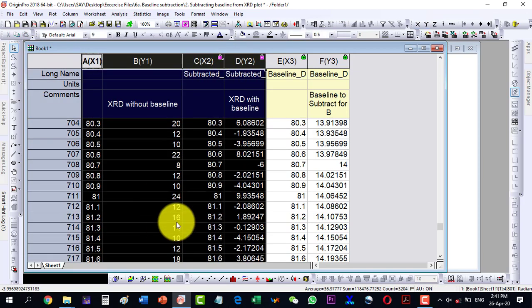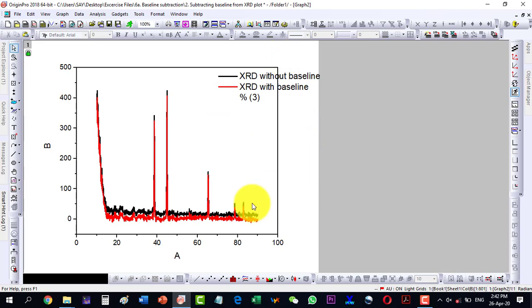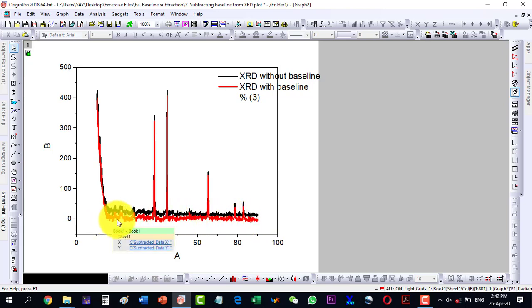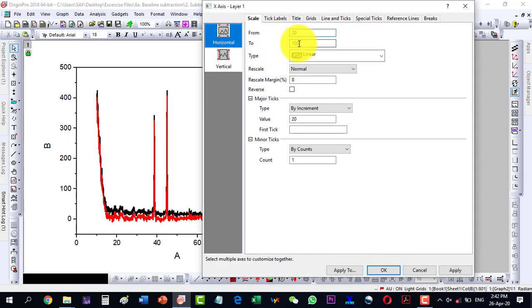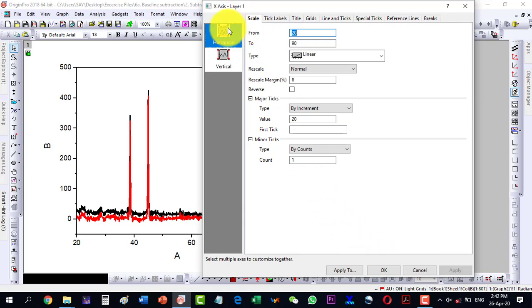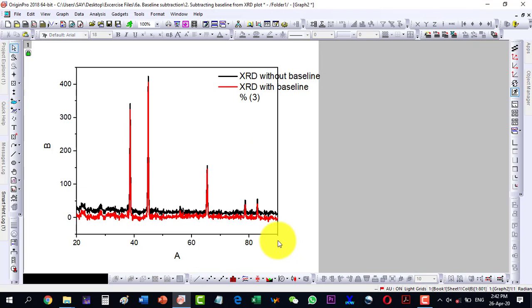Now I can plot both datasets. Here we can see that the data has been changed — from here to here it is now almost straight. Let me plot from 20 to 90 degrees and apply it. So this is now the baseline-corrected XRD data.